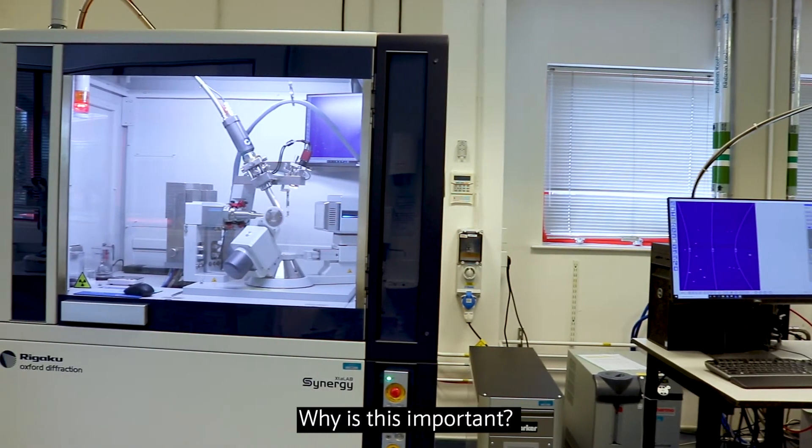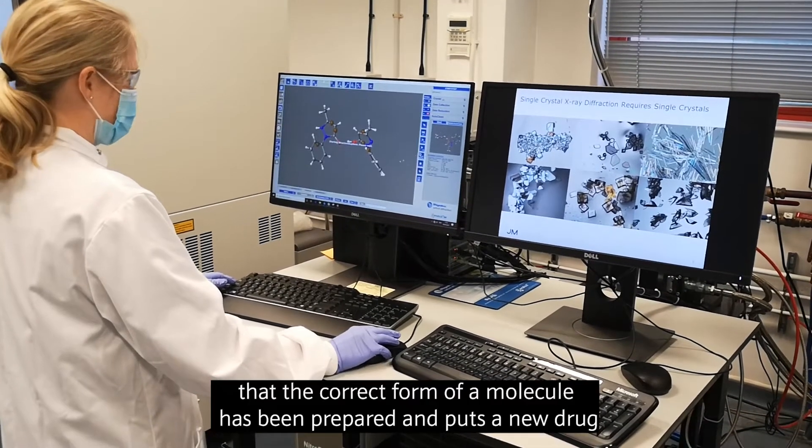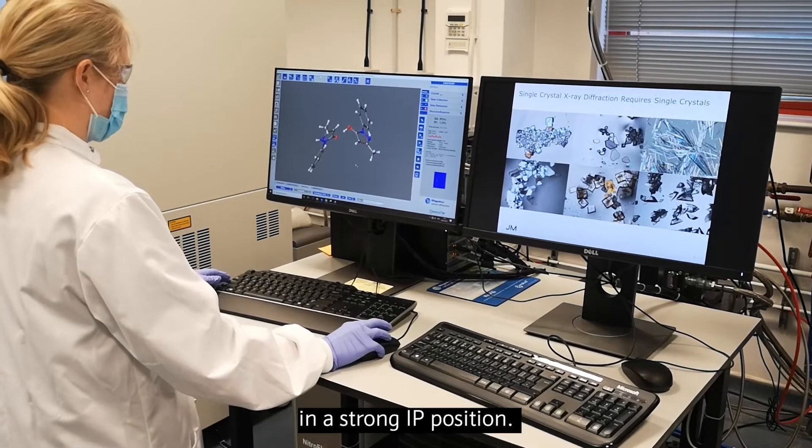Why is this important? Because an accurate molecular model is crucial to confirming that the correct form of a molecule has been prepared and puts a new drug in a strong IP position.